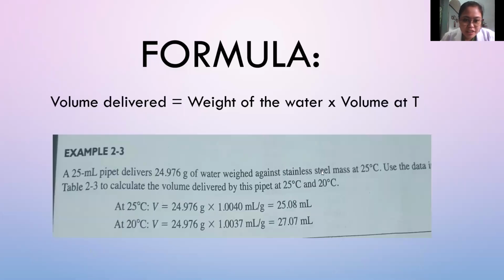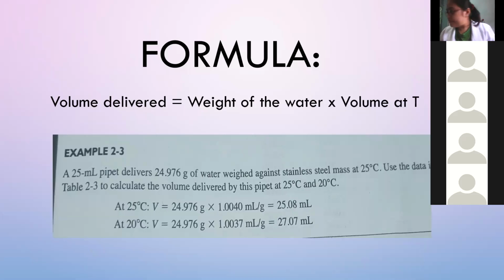Okay? So, mao ni siya ang pag-compute para makorek ang volume na na-deliver or na-contain sa ato ang mga equipment, katong burette, pipette, and volumetric flask. Questions, class?